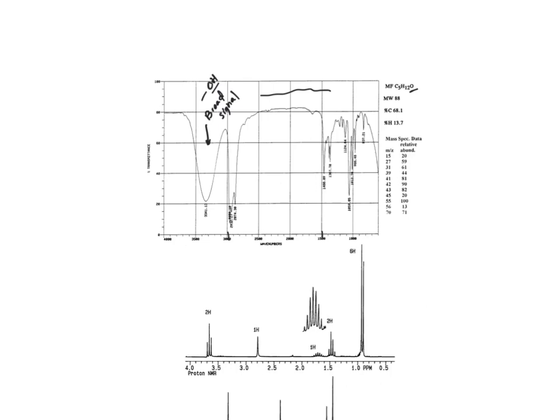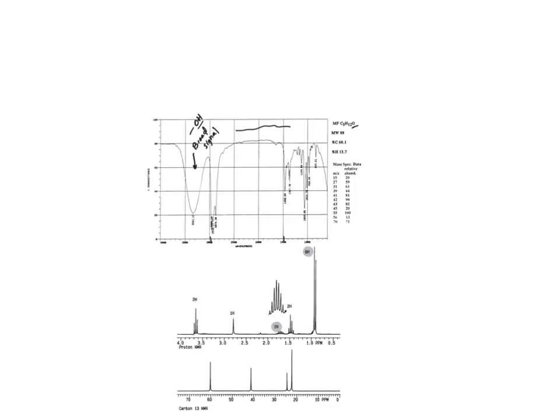So you go through this, you do the exact same thing. Note in the H1 NMR, we have a 6 proton doublet, and we have a 1 proton septet. So we've kind of gone over that. There are other signals, and now we're going to start to be able to do stuff with where they end up with respect to their chemical shift, due to the fact that you do have an electron withdrawing group. You have a functional group present in this molecule. Okay, so go ahead. When you're done with these, take pictures of them and upload them to the quiz.